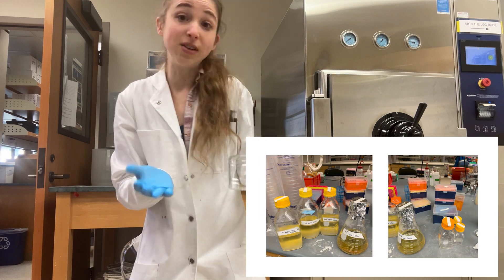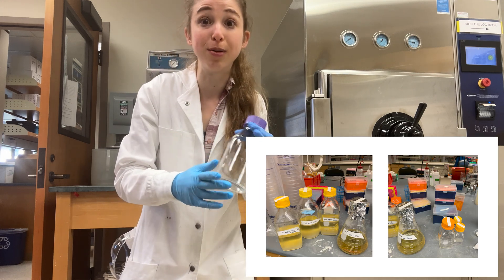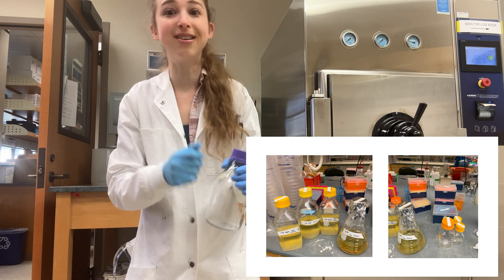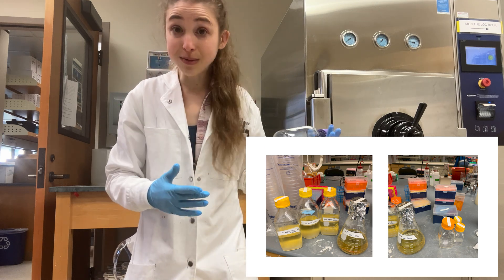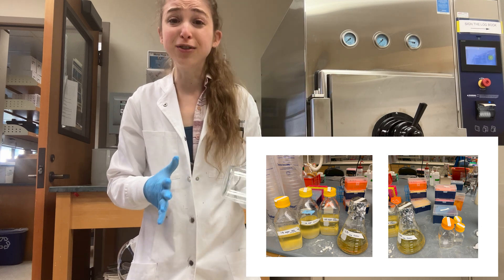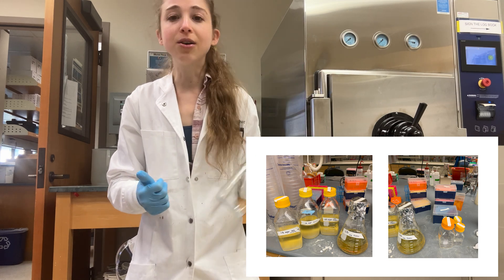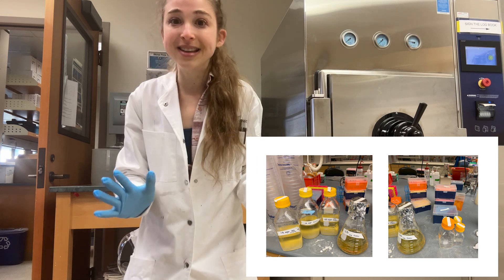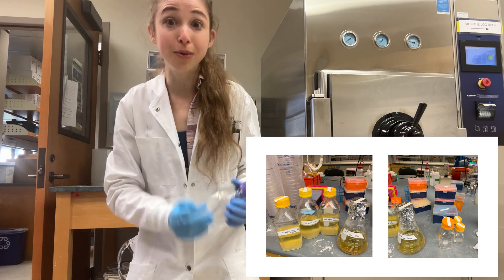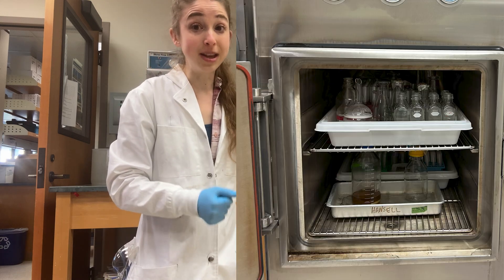It's really helpful if you need things sterile. Maybe you're making media — bacteria food — and you don't want other bacteria growing in there before you put in the bacteria that you want to grow. Also, if you have bottles that you're going to make buffers in and you don't want fungus growing in them. So there are lots of reasons to use a sterilizer, but it's not actually going to do the physical cleaning for you — you have to do that beforehand.